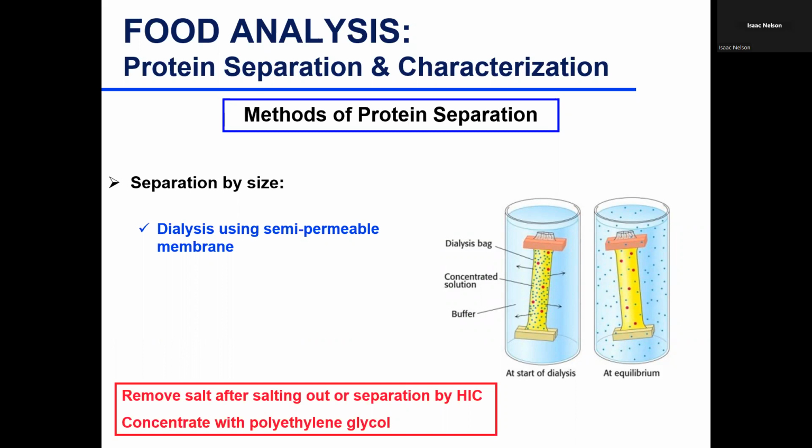Okay, let's get back to class. A method of protein separation. Are you with me? Are you in class? Welcome. A method of separation is based on size. So this is the first slide for separation methods based on size of the proteins.